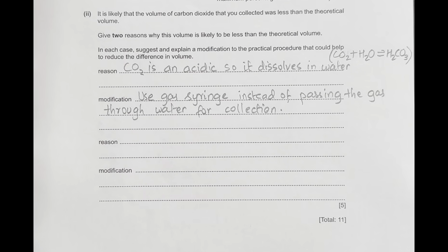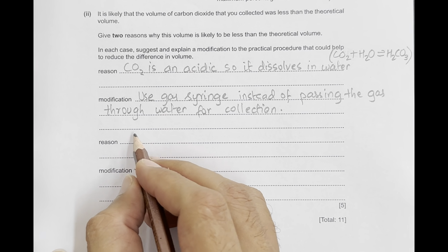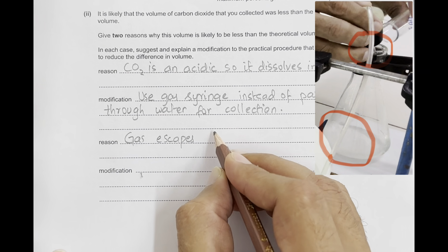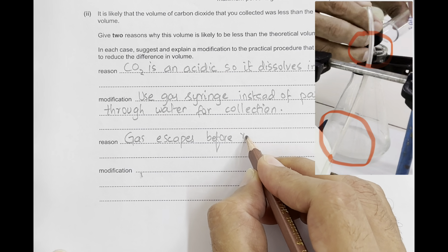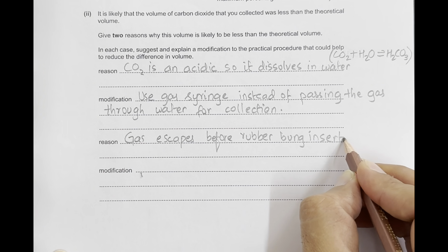Now, the second reason could be the problem we have seen that the reaction has started suddenly. As soon as we have added the acid, it has started to react. So a bit of gas was also escaped. So the second problem was gas escapes before the rubber bung is inserted. Now, how can we improve this?